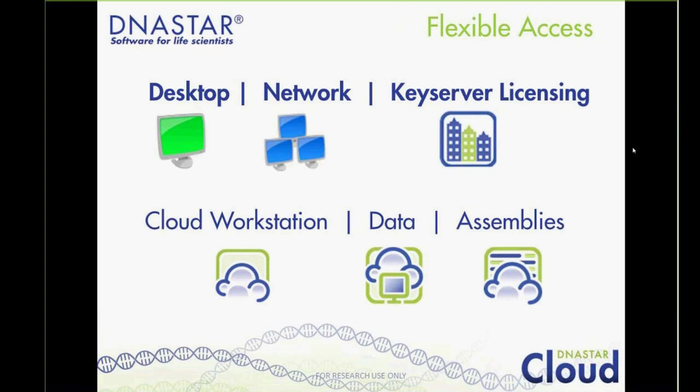And then finally, point out that ease of use and flexibility of access is a hallmark of all of the software I've discussed so far. All of the Lasergene software is available on desktop platforms as well as cloud platforms that allow you to access your data and your projects from anywhere in the world. And in addition, we have flexible licensing options, so we can really provide you with the best solution for your organization's needs. So with that, I'm going to now get into the software demonstration.